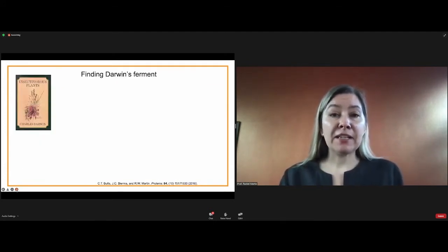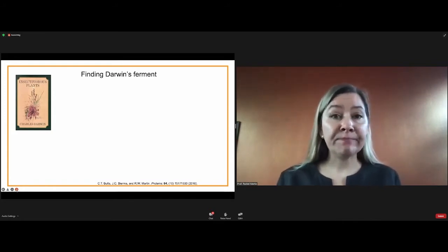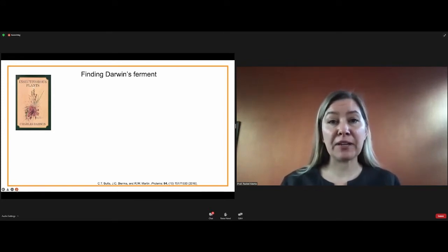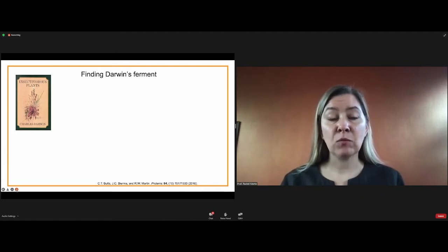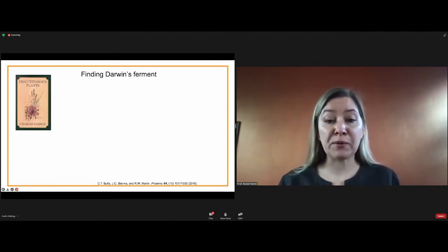So now what? It's hard to figure out what to do with so much data. A typical eukaryote has tens of thousands of genes. We can't make them all. We definitely can't do NMR on them all. So what are we going to do?